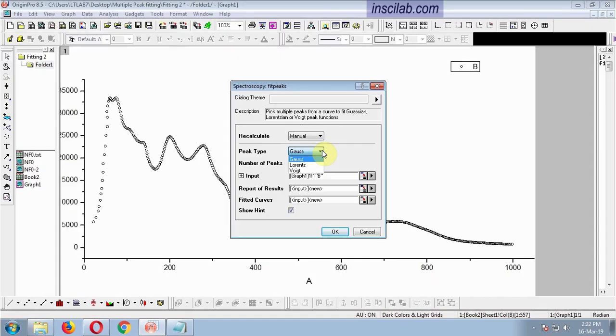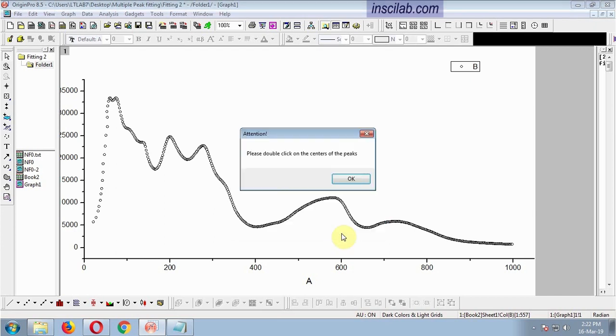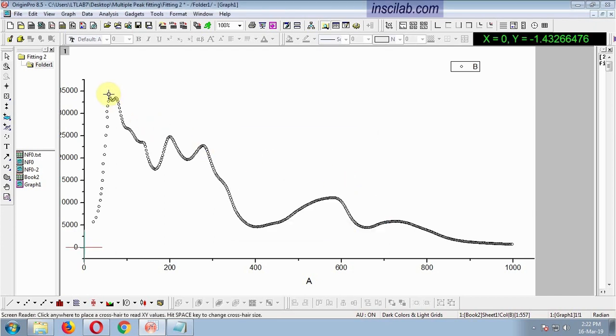Here, I will go with Lorentz first. The number of peaks, 14. Here, my suggestion is, go as slow as possible. If you think you did wrong at one of the peaks, do it again for all. I will go very carefully.